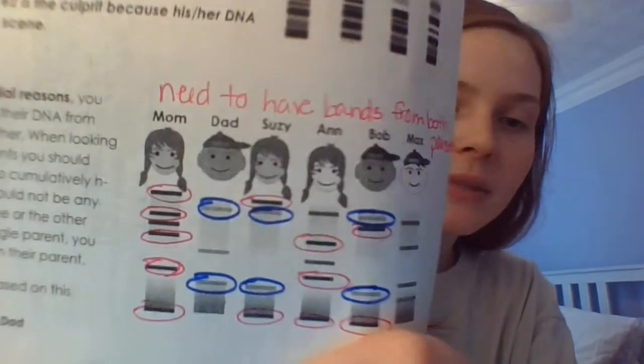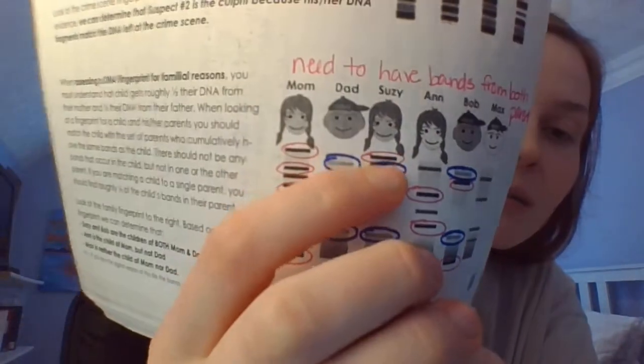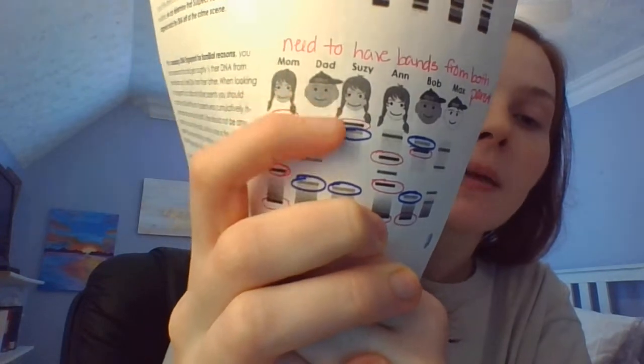One of those is not their biological parent. So we have mom, dad, 4 kids. What you're going to do is you're going to see if Susie has a band, is it from mom, is it from dad? If she has a band from neither, that says that one of them is not the parent, or both of them aren't the parent. Okay? So let's go through Susie's. Move this so I can see.